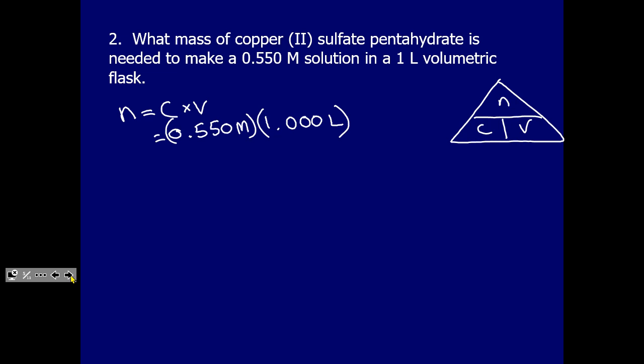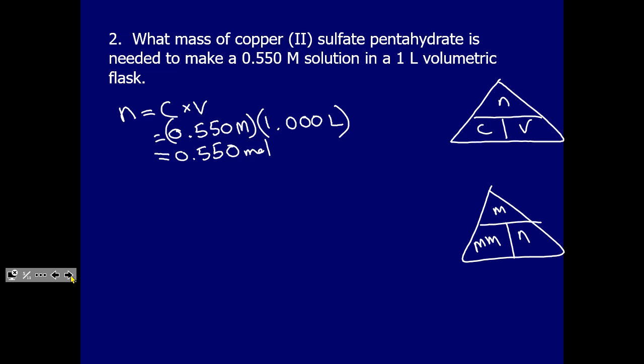Again, even with questions like this on the test, I'm not going to get super picky if you didn't put 1.000. But this lesson is about using equipment like this. That's the proper way to express it. And I can do this calculation. And because we did moles per liter times liters, we get n, which is moles. Notice I only keep the 3 digits because that's my least precise information. Right there, it's only got 3. Now I can get the mass. And I could roll that through.